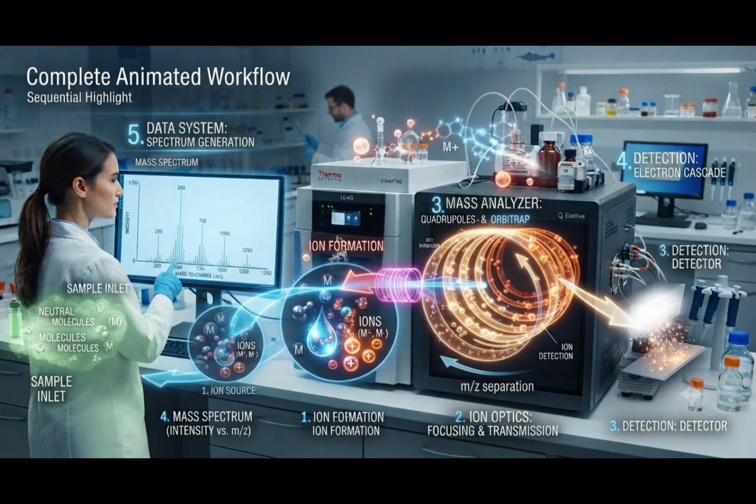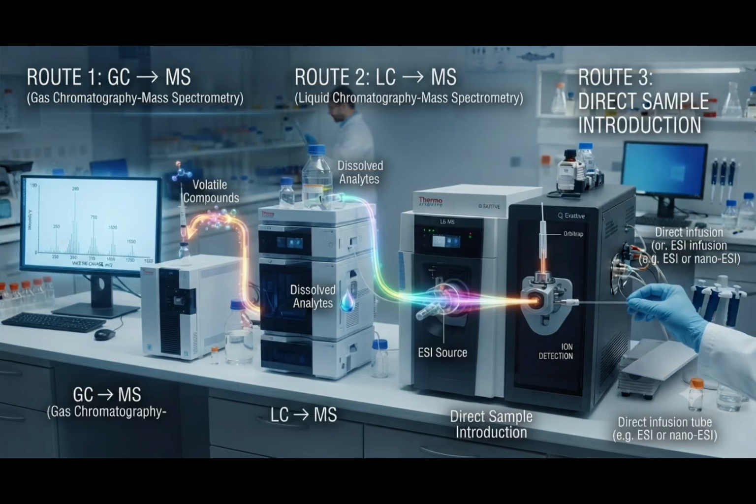Sample introduction. Before entering the mass spectrometer, the sample must be introduced into the instrument. Depending on the analytical technique, samples can be introduced directly or through a separation technique, such as gas chromatography or liquid chromatography. When gas chromatography is coupled with mass spectrometry, the technique is called GC-MS. When liquid chromatography is coupled with mass spectrometry, it is called LC-MS.